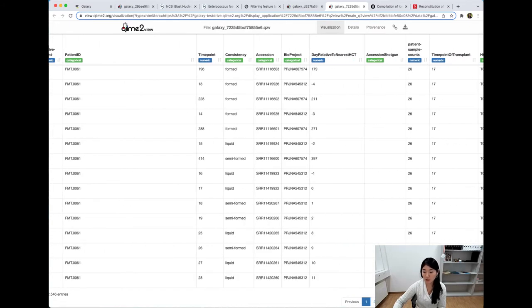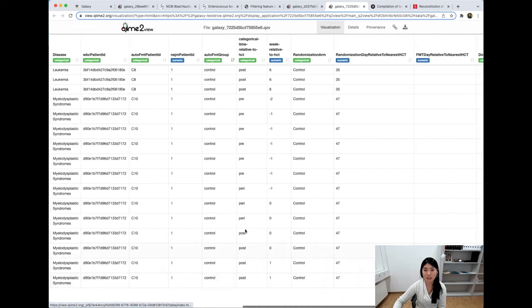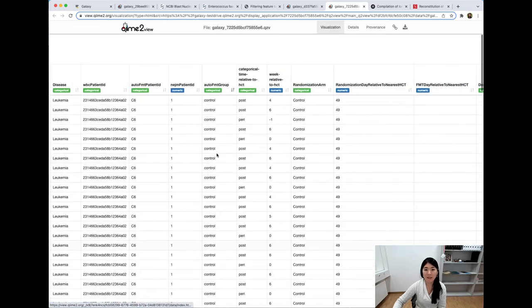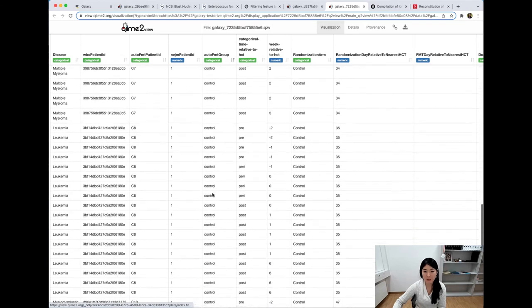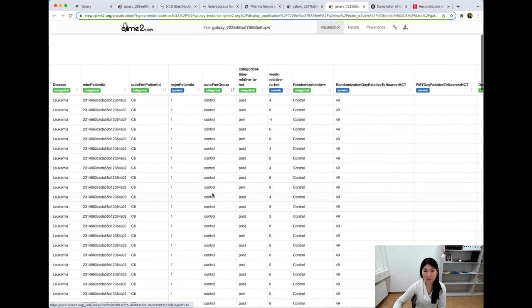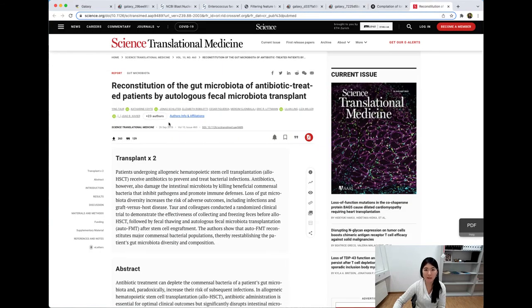If we scroll to around the fifth page, we see samples that under auto FMT group are considered controls — these samples were also part of the auto FMT study but were not given the treatments; they were given the controls. And of course, we have all sorts of other samples with blank entries under this column, which just means they were not part of this study. So knowing that, let's go back and filter our data to look for data that was only part of this auto FMT study.